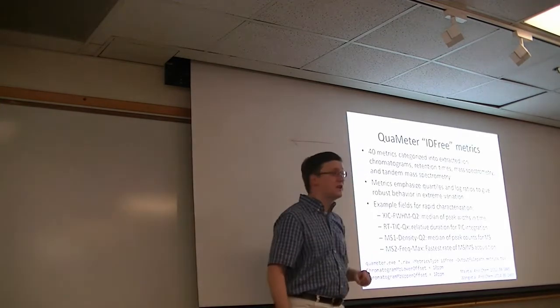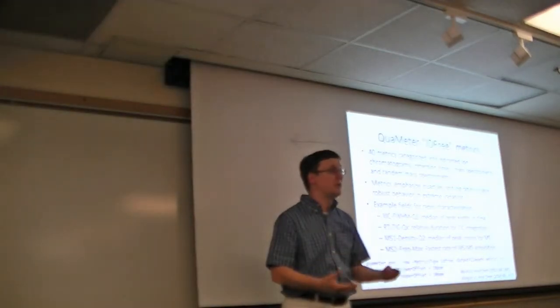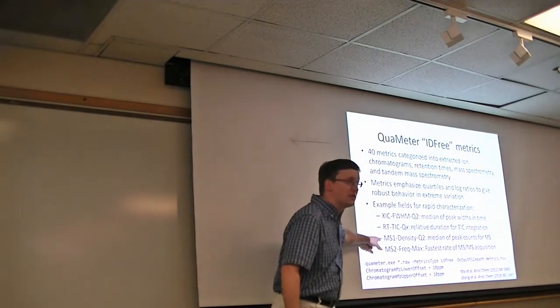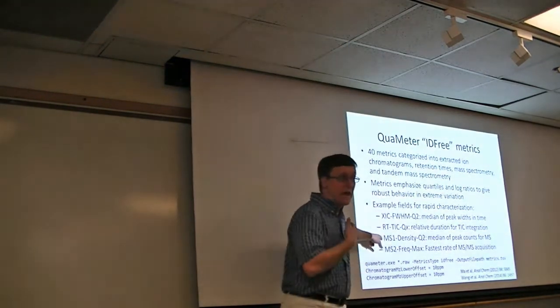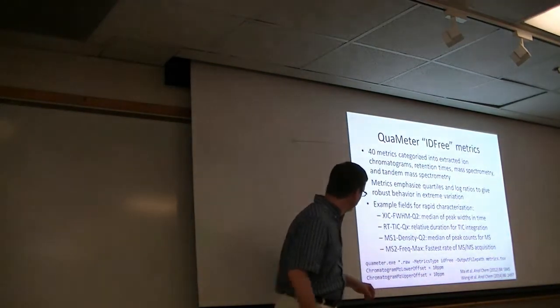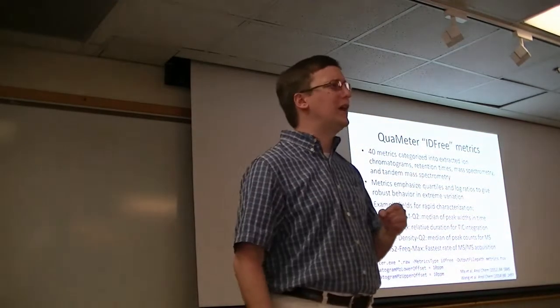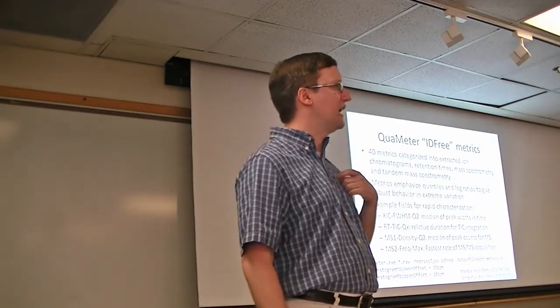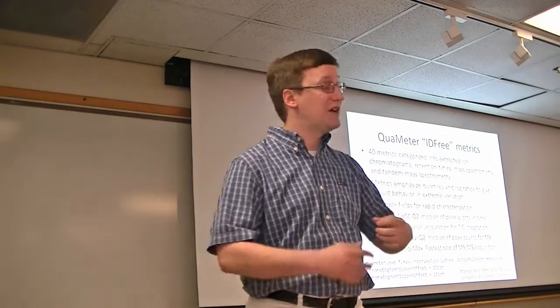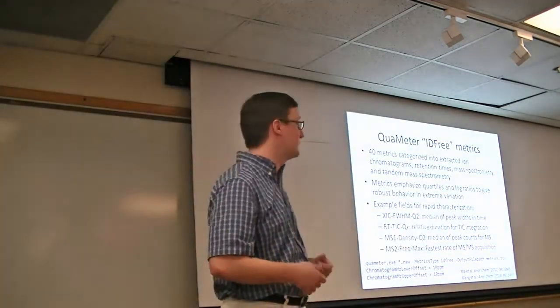Frequently, we want to know things like how noisy are the MS scans. If we change the injection time, are we getting more peaks or fewer, for example? So we have features like this MS1 density, which asks simply how many peaks are seen in each MS scan, and then figures out what the median of all of those would be. But this last one I kind of think of as the burger counter. A lot of people care a whole lot about shots on target. So essentially, how many tandem mass spectra are we producing in an individual experiment? If it's a lot, then we have a lot better chance of identifying lots of peptides, for example. If we have relatively few, we're not doing so well.